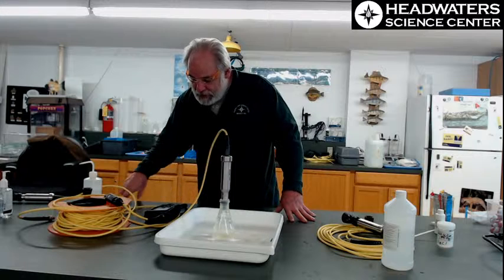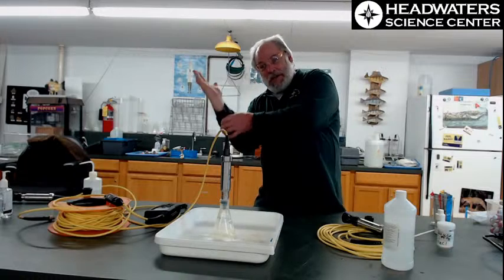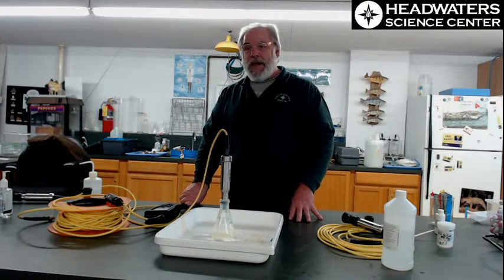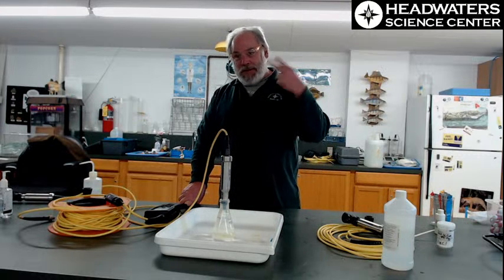Let me see how close I was. 106.5. So I was a little off. This DO meter was slipping about 6% off. Now it's recalibrated to 100%. And when we go back out there, we'll be both accurate and precise.